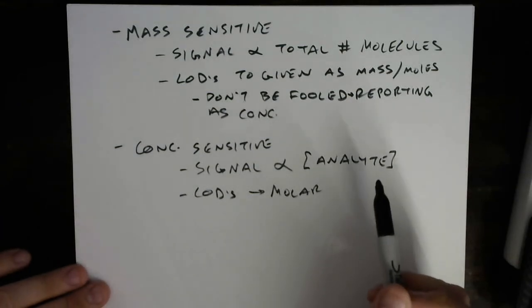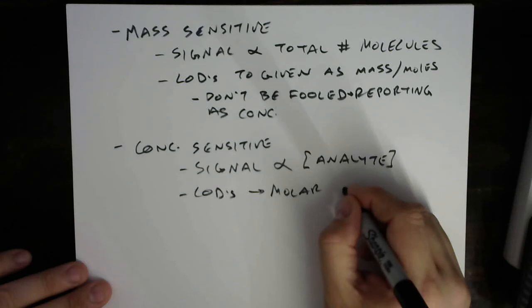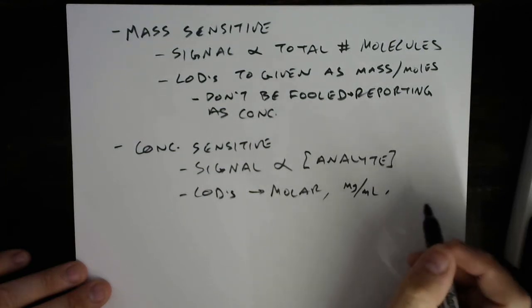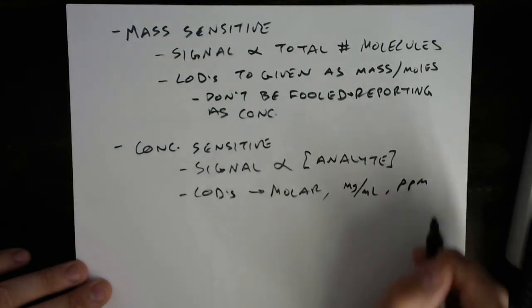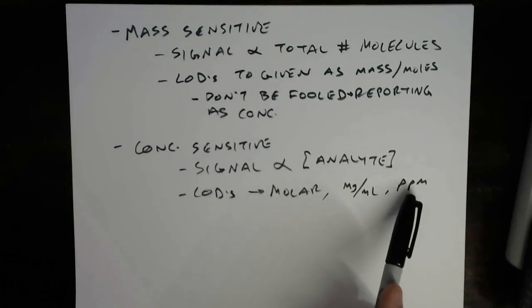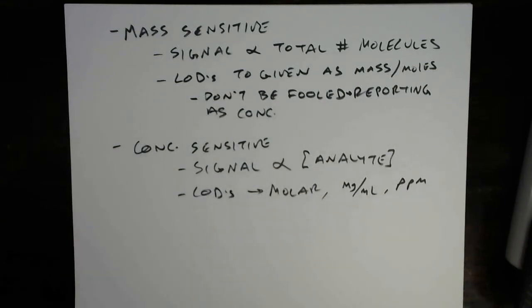Micromolar, nanomolar, picomolar. Or it's often given in something like mgs per mil, mass per volume. It's not uncommon to see detection methods here listed as ppm or ppb or ppt, which again is a concentration, right? Because it's parts per another amount of parts. So it's a ratio like any concentration should be.